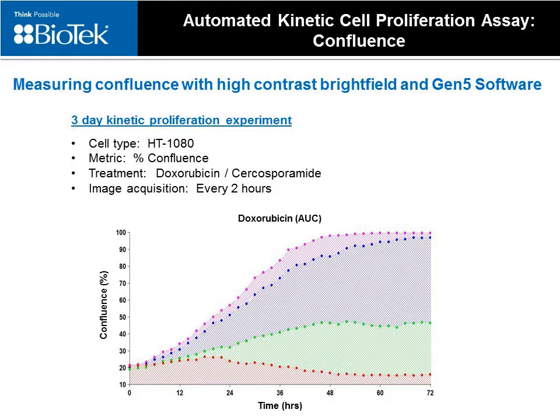Additionally, measuring the area under the curve, or AUC, for each of these profiles enables the incorporation of treatment effect over time into the quantitative analysis. AUC values are generated within Gen 5, and these provide a unique method for comparing proliferation rates across treatments.